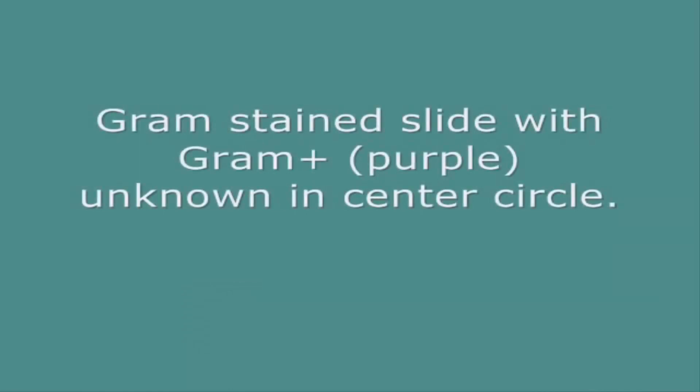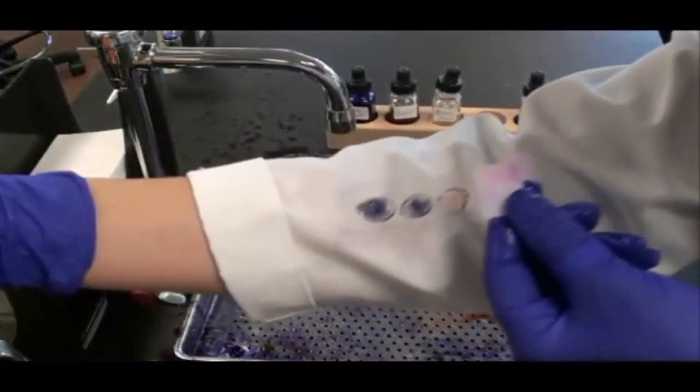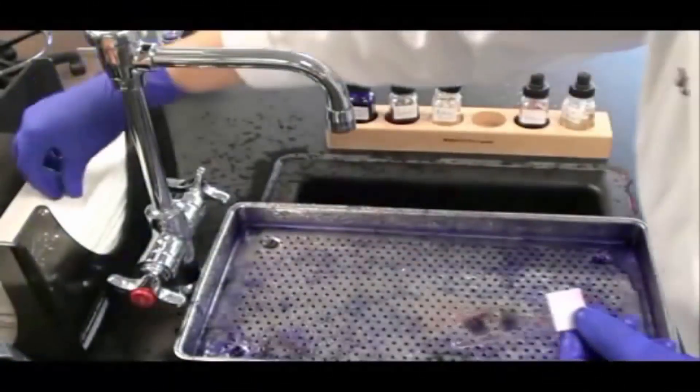I'd also like to show you an example of another slide that I prepared with a Gram-positive unknown. You see my positive control on the left, my negative control on the right, and this unknown is purple like the positive control.